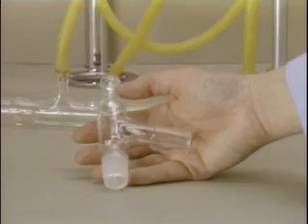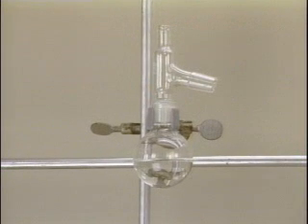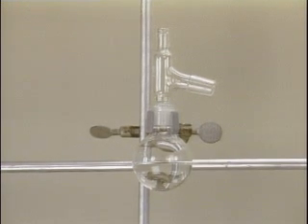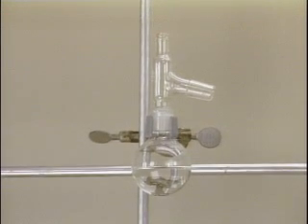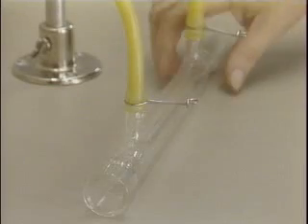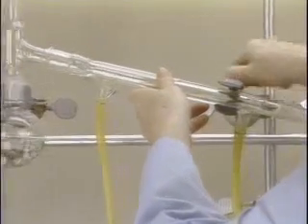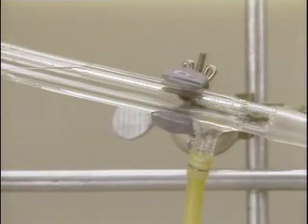After the flask is filled, a Y-shaped distillation head is placed in the flask with a smaller opening directly above the center of the flask. This head serves two purposes. It connects the flask to the condenser and also holds a thermometer in the vapors which rise from the flask during the distillation. The boiling point of the material that is distilling can thus be observed. Next, the condenser is attached to the distillation head and clamped loosely to another support stand. The condenser should rest on the bottom of the clamp so that it can be tightened from the top when final adjustments are made.